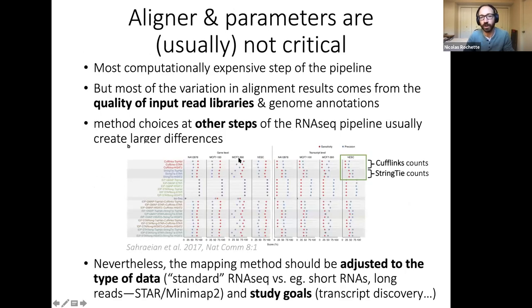One thing I would like to mention though is usually, if your data is relatively clean, if your problem is relatively simple, you're not going to see a huge difference depending on what exact solution you use for your problem. If your data is clean, then this is usually not going to make a difference.